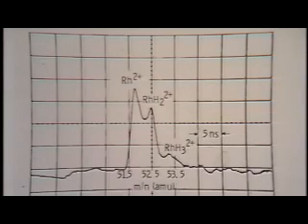We're talking about travel times of the order of 10, 20, 30, 40 nanoseconds for hydrogen, depending on the voltage. And here's rhodium hydride, part of an examination of rhodium hydride, just to show you that with a very simple time-of-flight mass spectrometer, you have single AMU mass resolution at the low end of the scale.